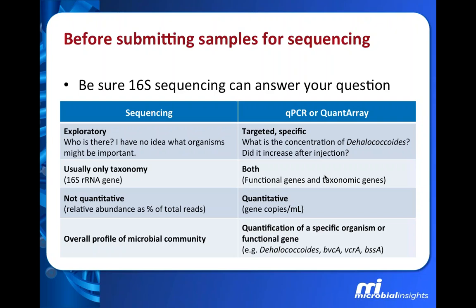Next generation sequencing also gives you an advantage over qPCR in that you're getting your microbial community as a whole. We can't do that with qPCR. We can't target unknowns or do overall community profiling with those types of tools.